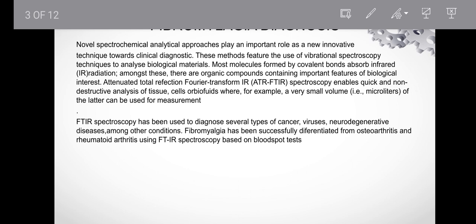Sample collection. Let us understand more about the application of FTIR by looking at a research study conducted by people from UK and Brazil. I'm not reading all their names. You can just Google them because all of them are famous scientists. Many of them are from the 2% scientist group. They have used this FTIR for the detection of fibromyalgia.